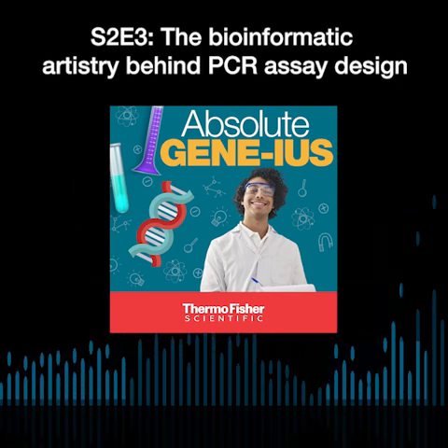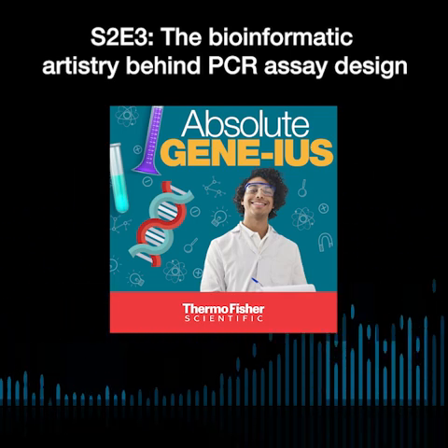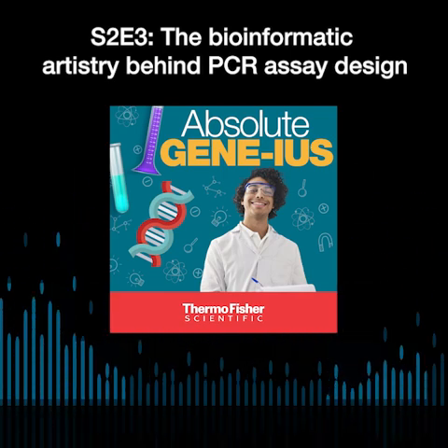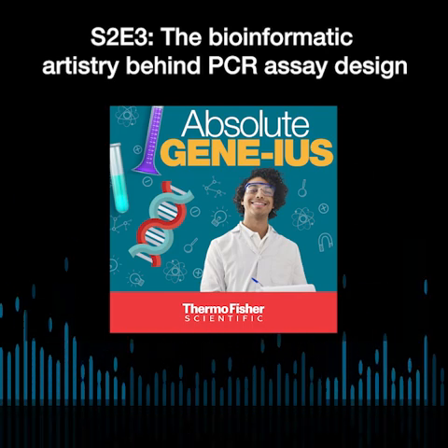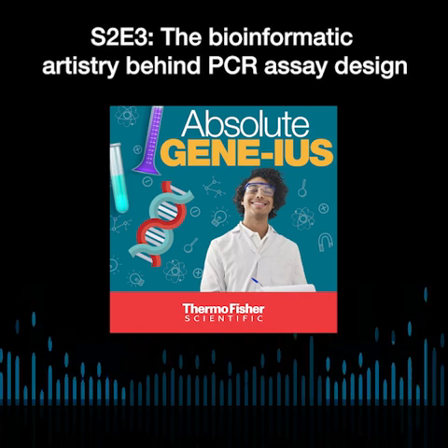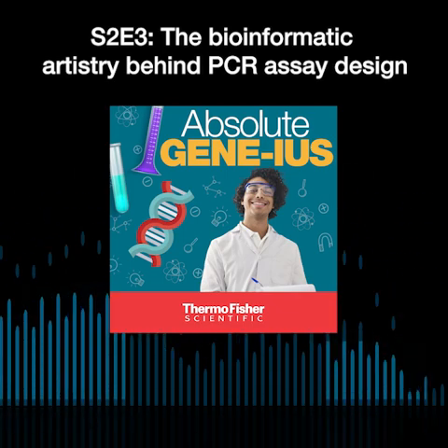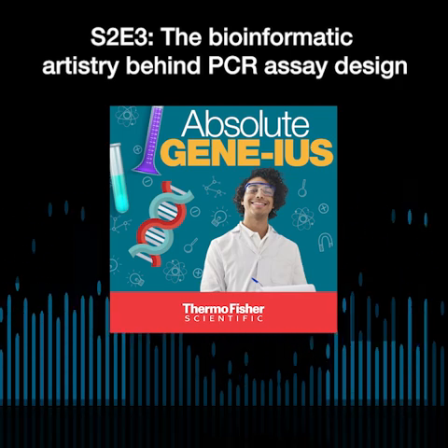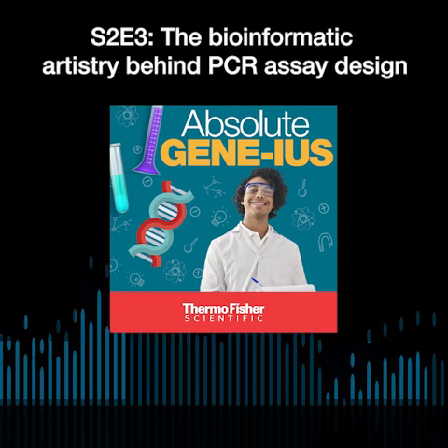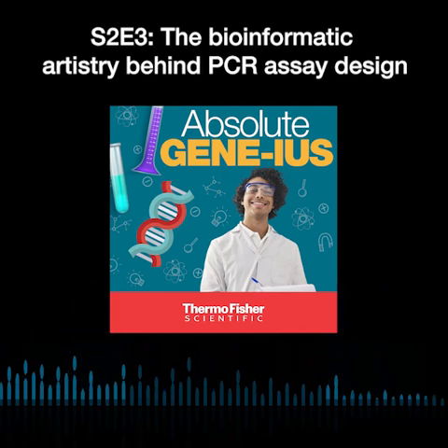I was going to add, after we have an assay designed and it's tested, and then we need to do some troubleshooting, some different things we'll play with are probe length, or if it's a SNP, so there's two probes, we'll play with whether the probes are right on top of each other, or we'll stagger the starts and stops. And then sometimes we'll also play with the quencher. So we have MGB or QSY quenchers, and then occasionally we'll also switch the strand of the probe, from the positive strand to the negative strand, just to try different ways of troubleshooting.